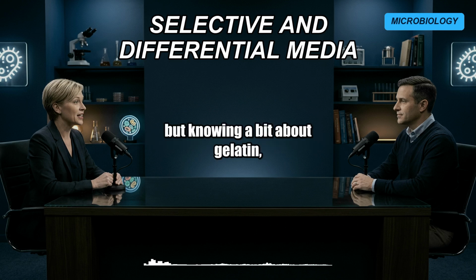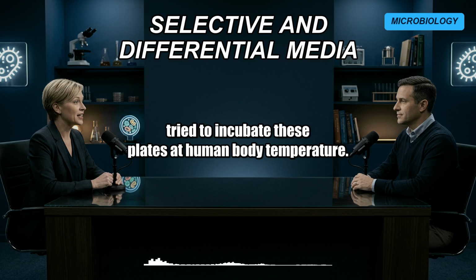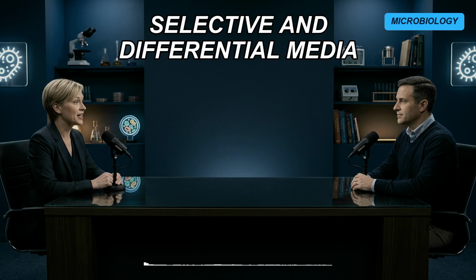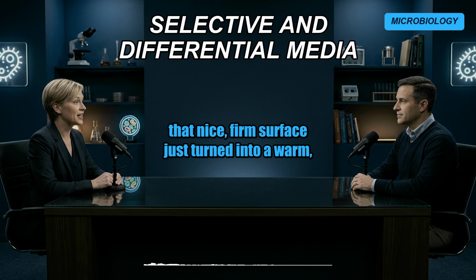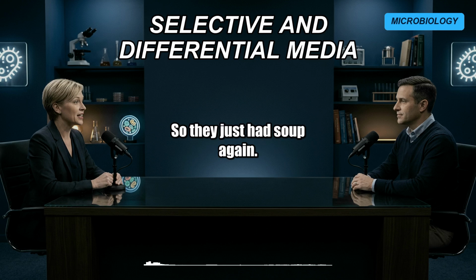I see the logic, but knowing a bit about gelatin, there had to be a massive physical limitation when they tried to incubate these plates at human body temperature. Oh, it was a total disaster. Yeah, because human pathogens generally need to be grown at human body temperature to thrive, right? Which is 37 degrees Celsius. And gelatin melts well below that. So the moment they put these dishes into the incubator, that nice firm surface just turned into a warm, useless puddle. Oh, wow. So they just had soup again.